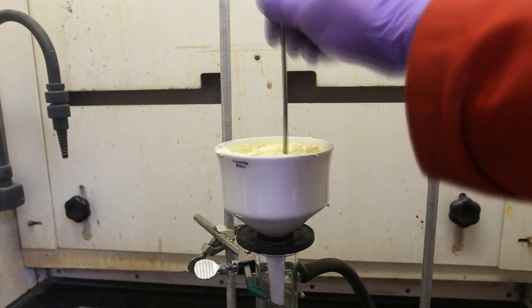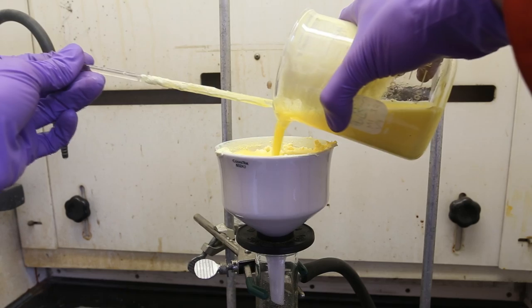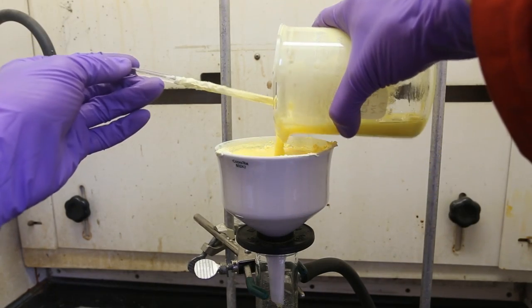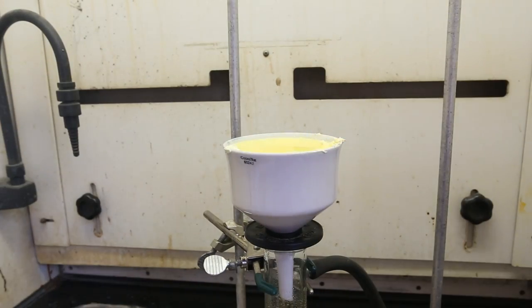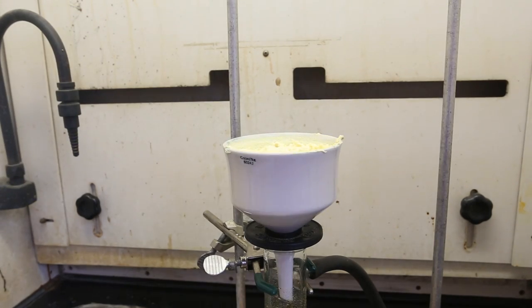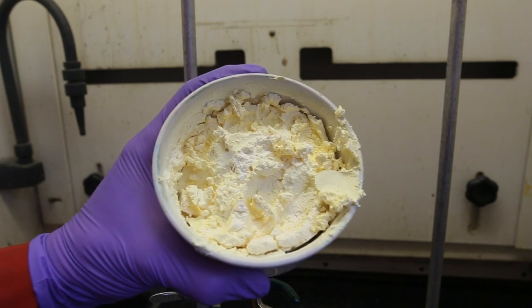There is still a significant amount of acid present in your product. However, don't worry about that, as the next step is a hydrolysis reaction, and we'll be adding acid anyway, so there's no use in washing away the existing acid and losing some of your product. I let my product dry under vacuum for quite a long time, but that's completely unnecessary, as in the next step we'll be adding it to water once again. What was interesting was that as the product was drying, it took on a scrambled egg-like appearance.